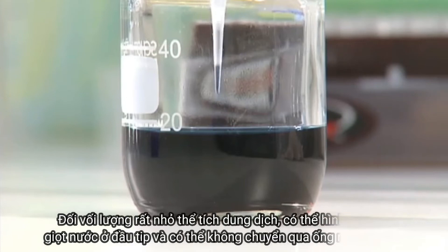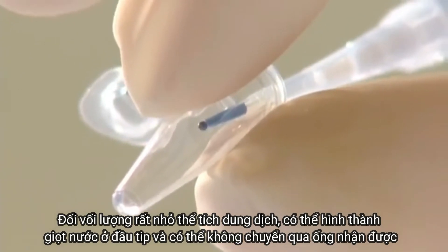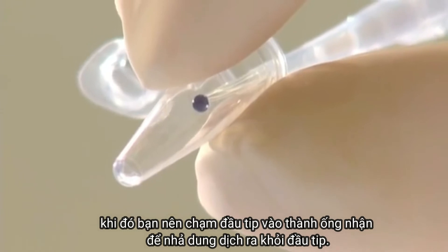For very small volumes, the aspirated liquid can hang in a drop from the end of the tip and may not be transferred to the tube at all. You should therefore touch the tip to the inside wall of the recipient container whilst expelling the liquid.